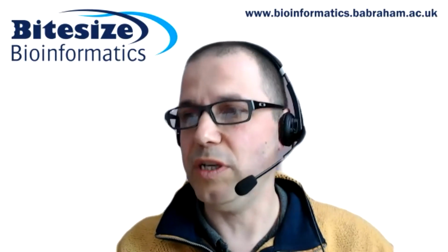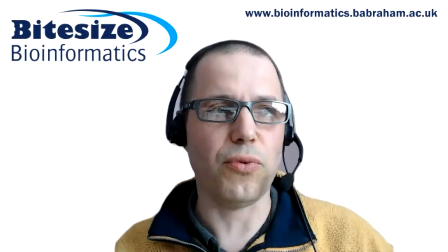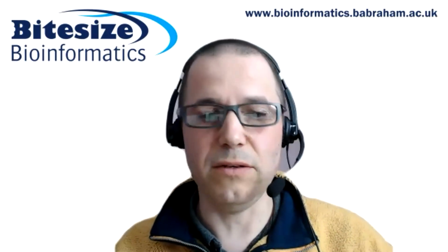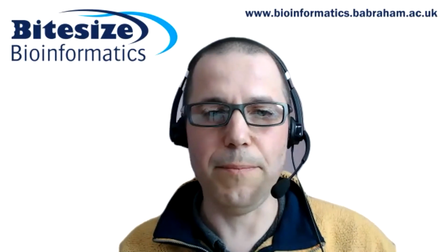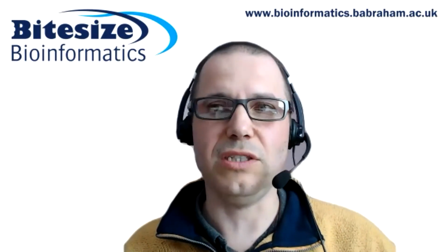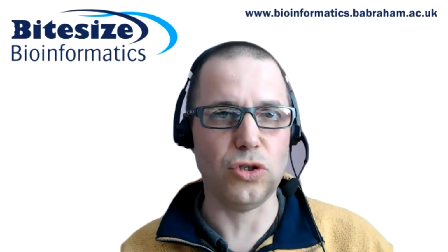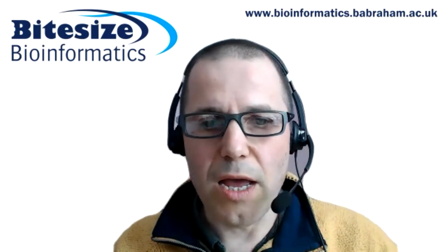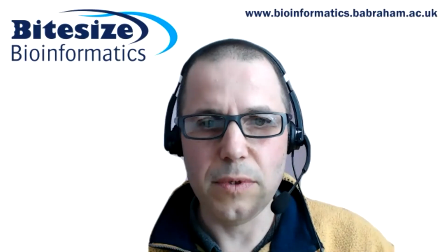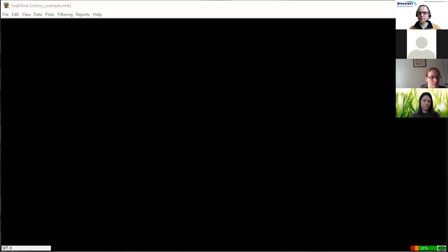So today all I'm going to do is talk you through what Vistories are, show you how they work in practice, give some tips for how to use them, and then finish up by showing you a thing called Vistory database, Vistory DB, where we're starting to collect some of these. So not only can we use these for recording analyses, but we're also using them as part of the training as well. I'm going to switch across then to open up a SeqMonk project that I've already prepared for this.